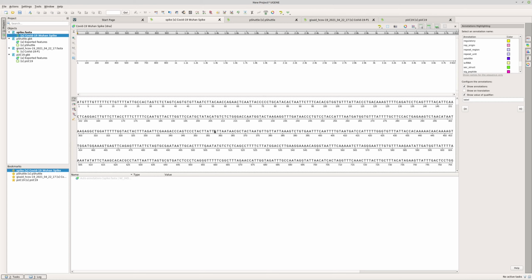And the way that we would do that in real life is we would perform a PCR with modified primers, right? So we would basically modify primers. We're not going to do that at this point because that would be a little bit lengthy of a process. So instead, what we're going to do is open up our text editor of this file. And when we do so, we're going to be able to just modify it very simply there.